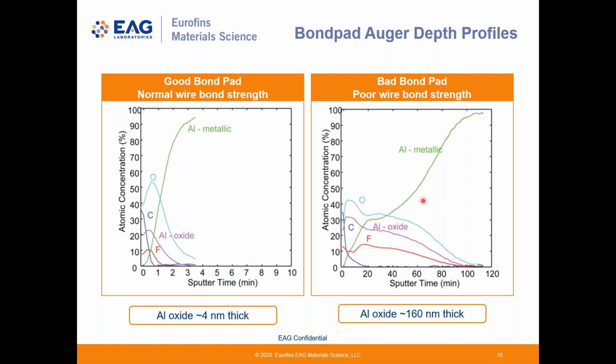So we could take advantage of this for several other items as well. We can see this for silicon, some other metal oxides, and we see this for carbides and some oxyanions of sulfur, phosphorus, and chlorine also, but not much else.